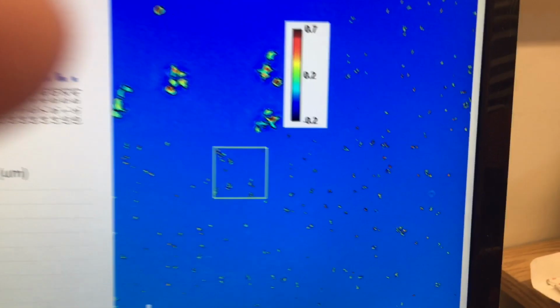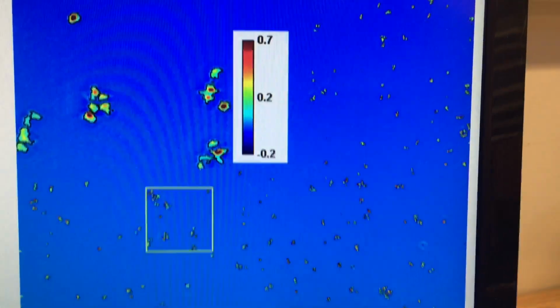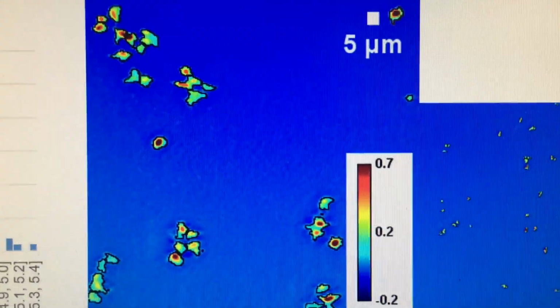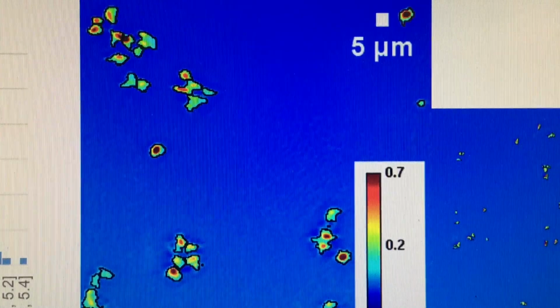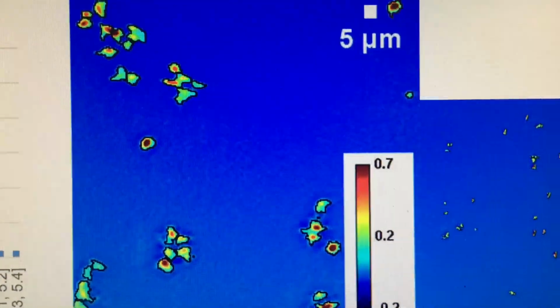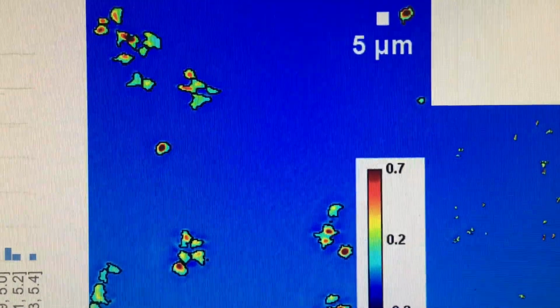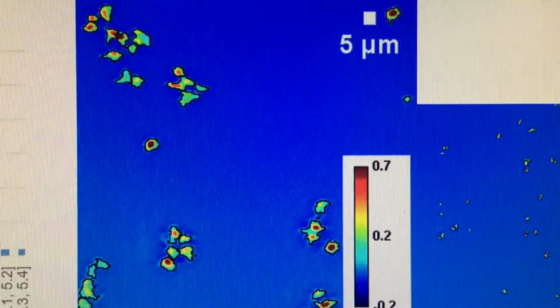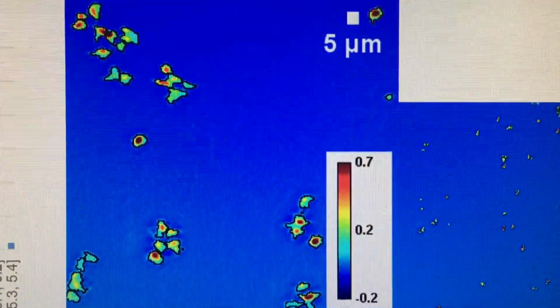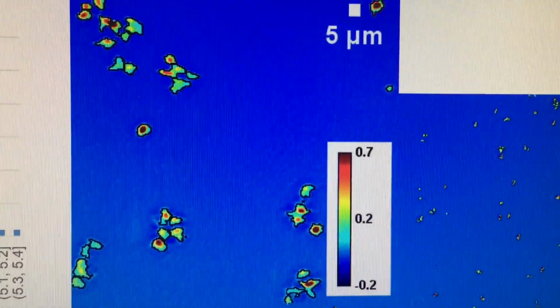Over here on the right is a screen showing the protein that was captured, and then this inset up here is just a sort of a zoom in, if you will, and what this shows is a measure of optical density. The areas that you're seeing are not tagged in any way. This is all just a false coloring, if you will, by the system. What this shows is the areas in red are denser and have more packed than the areas in yellow or green surrounding them.